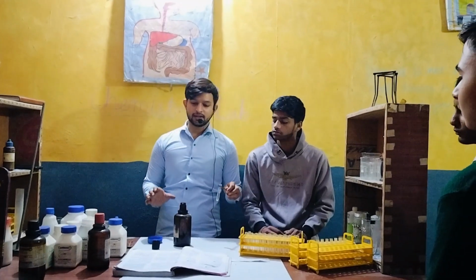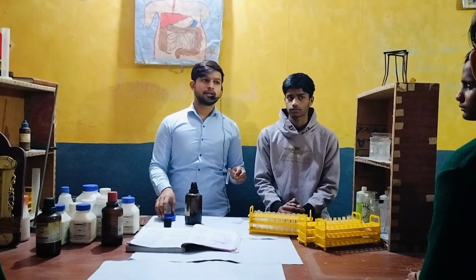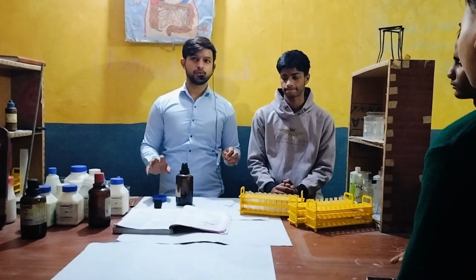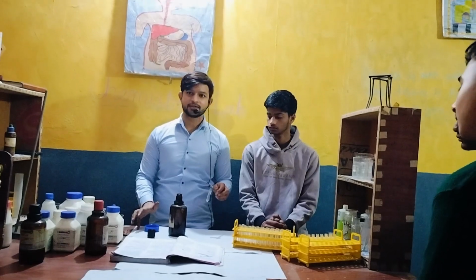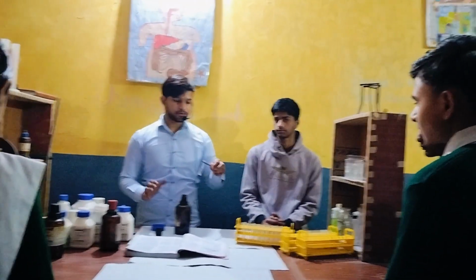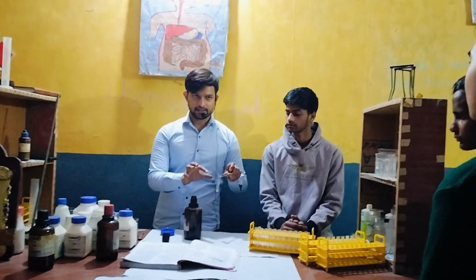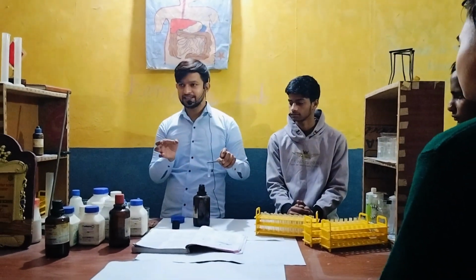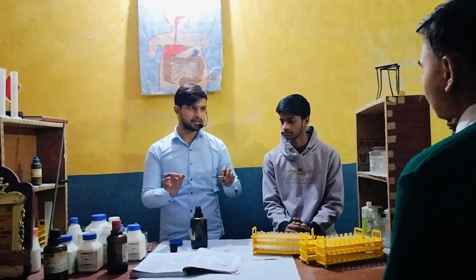We will learn about chemical reactions. What is a chemical reaction? The process in which two reactants react with each other and a product forms is known as a chemical reaction. So what we are going to do, we have taken a test tube. This is the test tube holder. We take the sulfuric acid into it, then we will place zinc granules. Then we will see that hydrogen gas comes out from it.